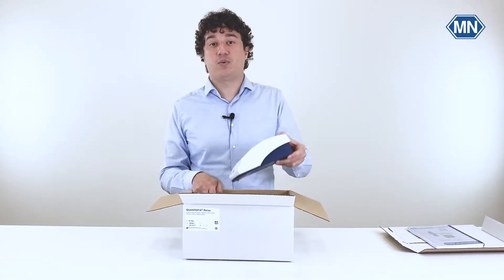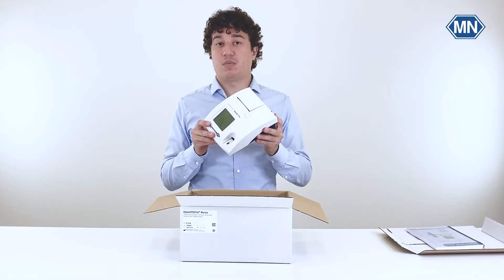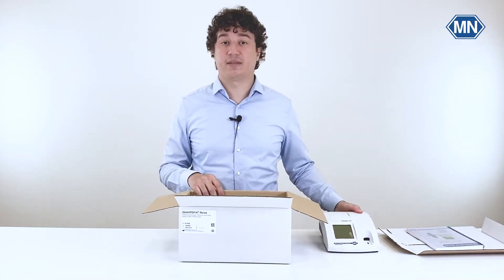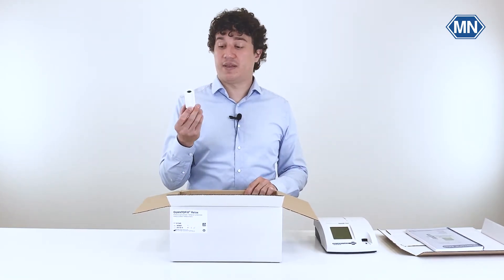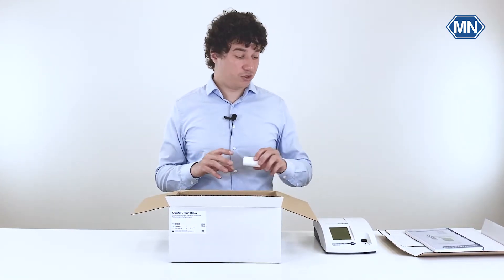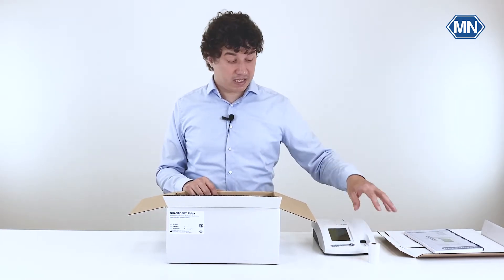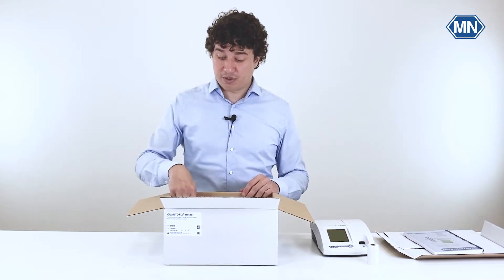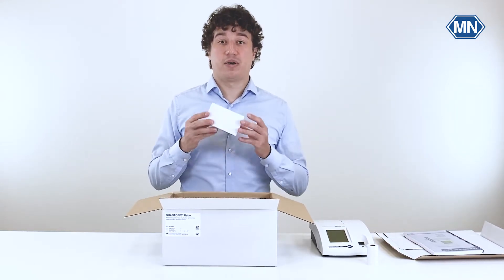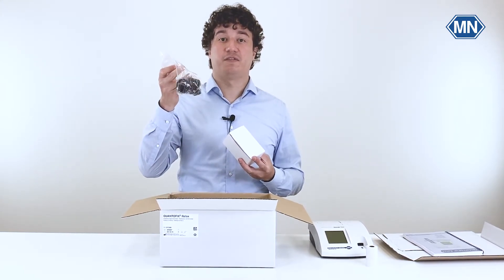The device itself is very lightweight so you can take it out with one hand. We will come back to this in a moment. Let's first look at what else you get inside this box. First there is a roll of printer paper which you can insert into the photometer to print out your results. And if you don't want to use this in a mobile application, for example with batteries, you can use the included power supply.